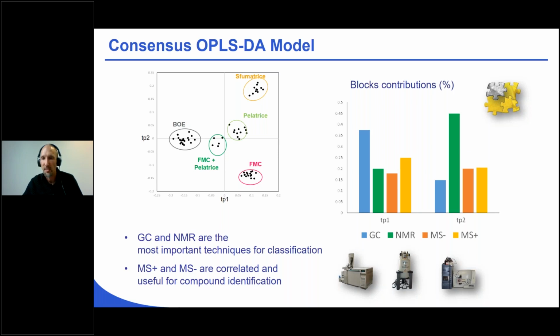And it is not to say that LCMS was not useful, but as you can see, there are signals maybe not as predictive as the two other matrices, but there were signals that were measured in LCMS that were very helpful to get more information in the annotation process.